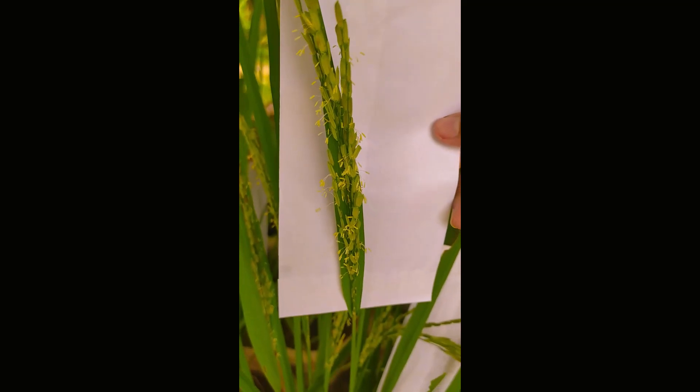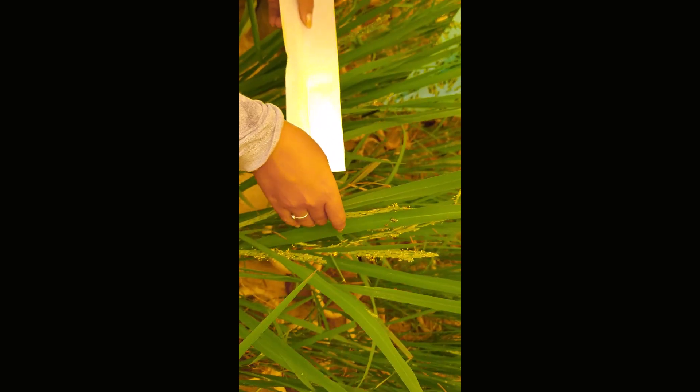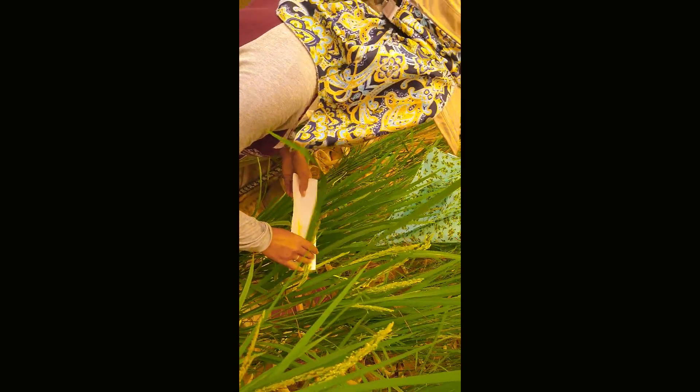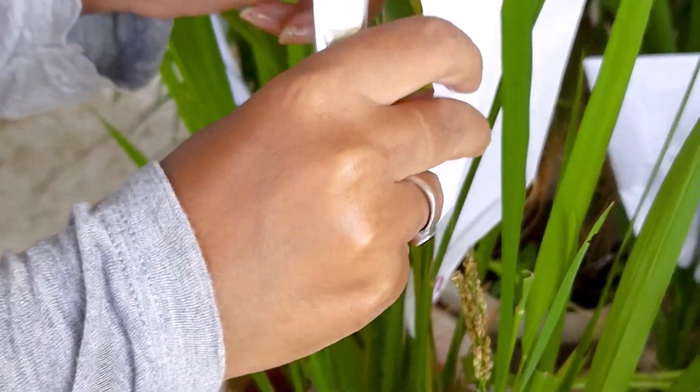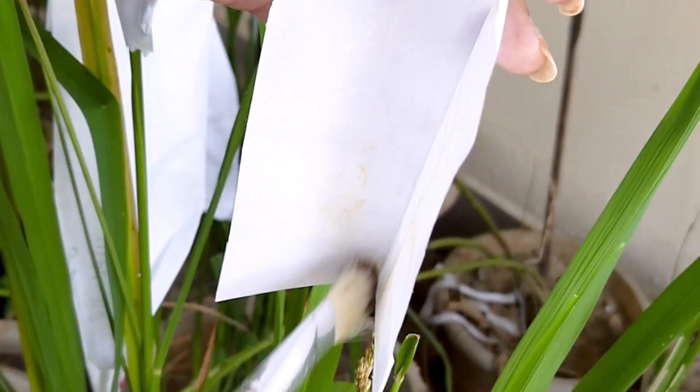Pollination is carried out the next day of emasculation. Anthesis begins in the morning from 8 am to 10 am, varying from variety to variety and also depending on temperature, humidity, and other environmental factors. It is important to keep in mind that the amount of seed set is determined by both careful emasculation and pollination. Mature, fertile, and viable pollen from the selected male parent are collected in a butter paper bag. According to reports, pollen viability of rice is usually 30 minutes and stigma receptivity remains for 2 to 3 days.